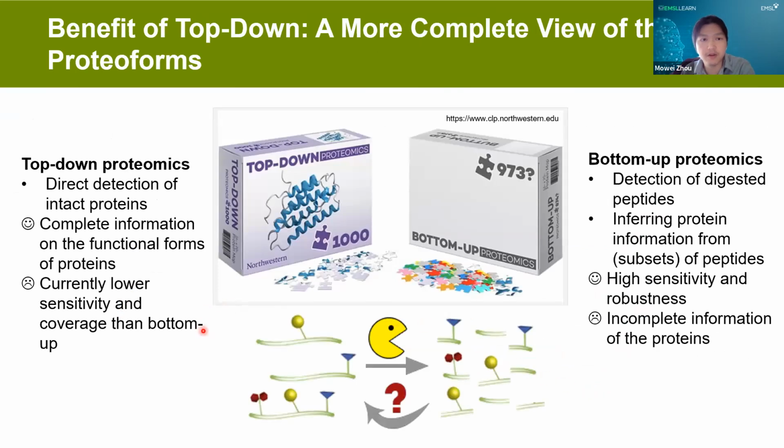And as a top-down community, we know that there are different advantages and disadvantages for different techniques. Bottom-up proteomics is very widely applied for detecting proteins. It relies on enzymatic digestion of the intact proteins into smaller pieces of peptides, which are easier to detect by mass spectrometry. So the proteins are inferred based on the detection of those peptides, or maybe subsets of peptides. It's a very robust and highly sensitive method, but there are some challenges of getting complete information of the proteins.